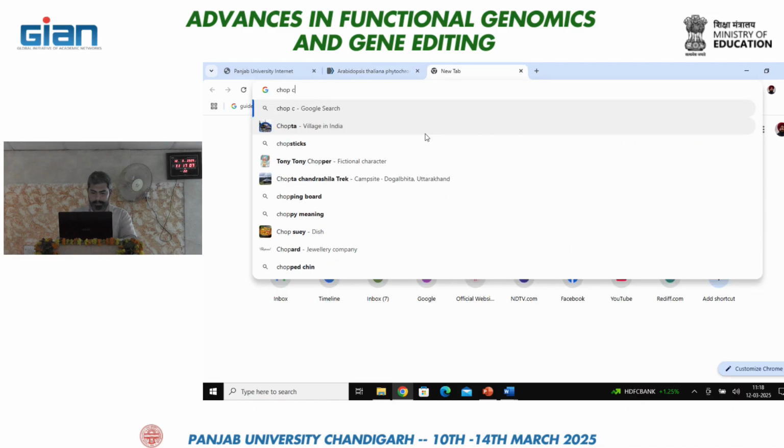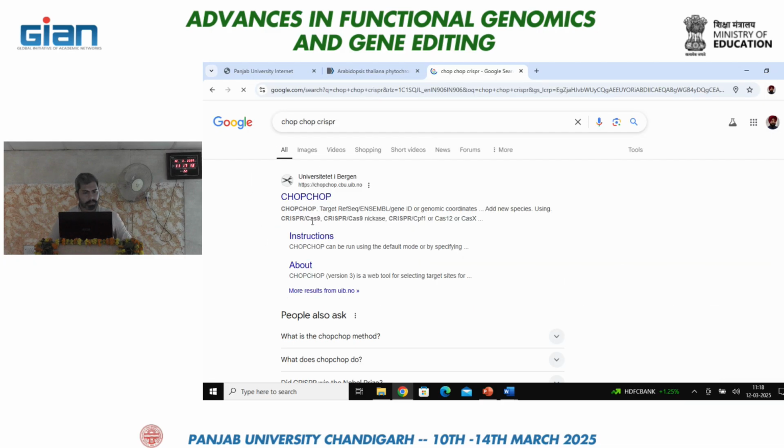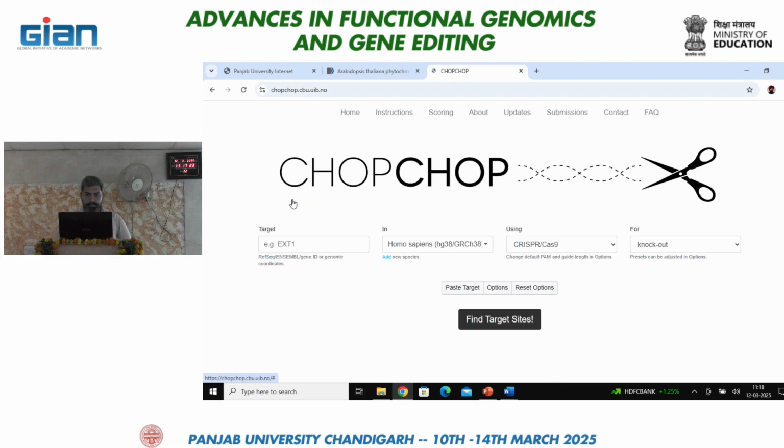You can just type chop chop and CRISPR, then you will be able to find this. And you can click on the first link. Okay, all of you have reached here.